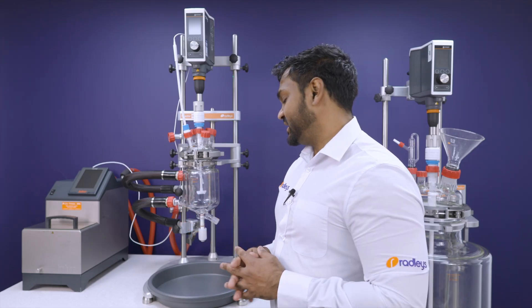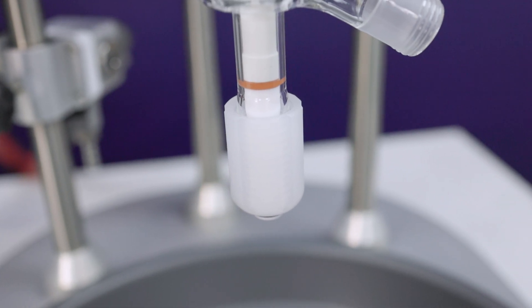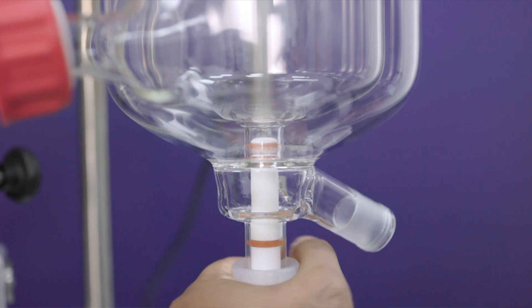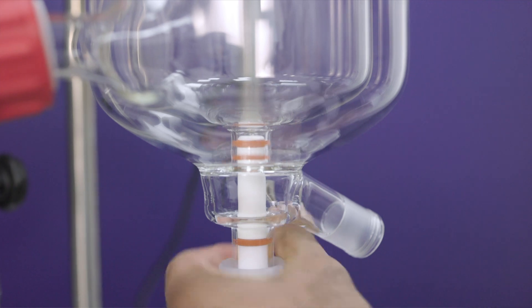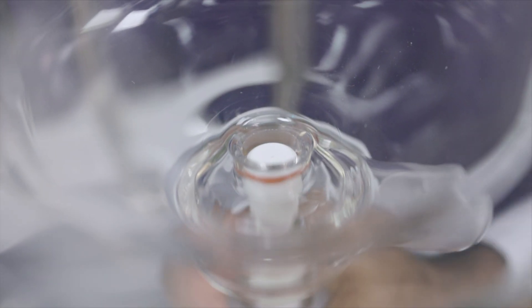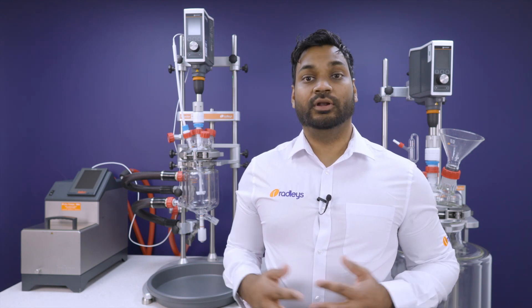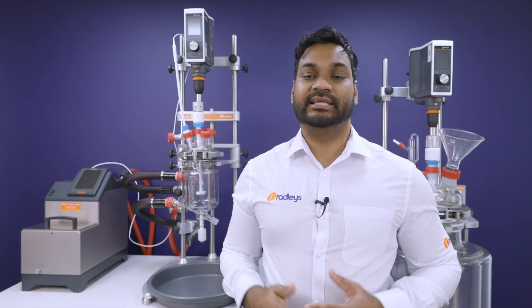Our zero dead space bottom outlet valves are another strength of our system. We seal the BOV with a piston within a precision bore glass tube, rather than squashing the piston against the bottom of the vessel. This means we get a better seal that does not leak over long runs or across large temperature ramps.